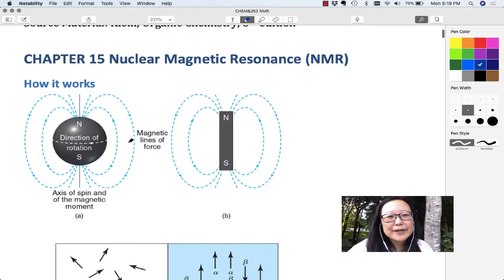And how that works is considering that nuclei have these particles, protons and neutrons, and those nuclei have a spin. We've heard about electron spin before, so electrons have a property called magnetic spin, and so we think of spin up or spin down, and we pair those when electrons get together in an orbital. All right, well, nuclei have a property called spin as well.